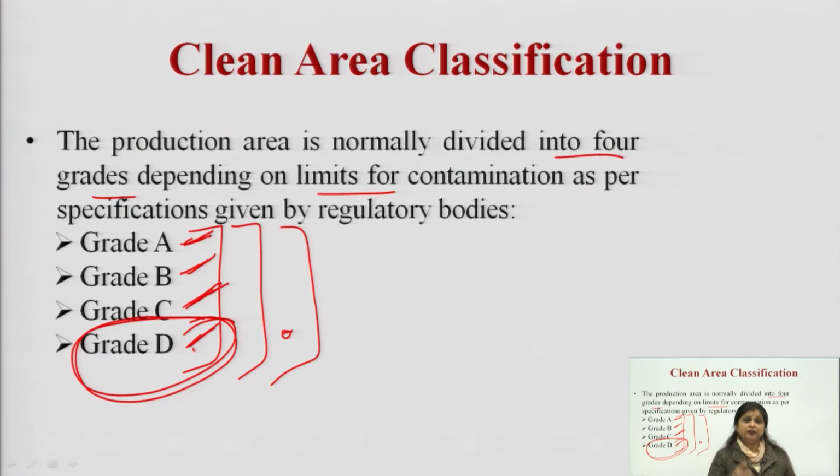That will have what we call HEPA. HEPA means high efficiency particulate air. These are filters which remove the dust particles and the microorganisms even from that aseptic area.